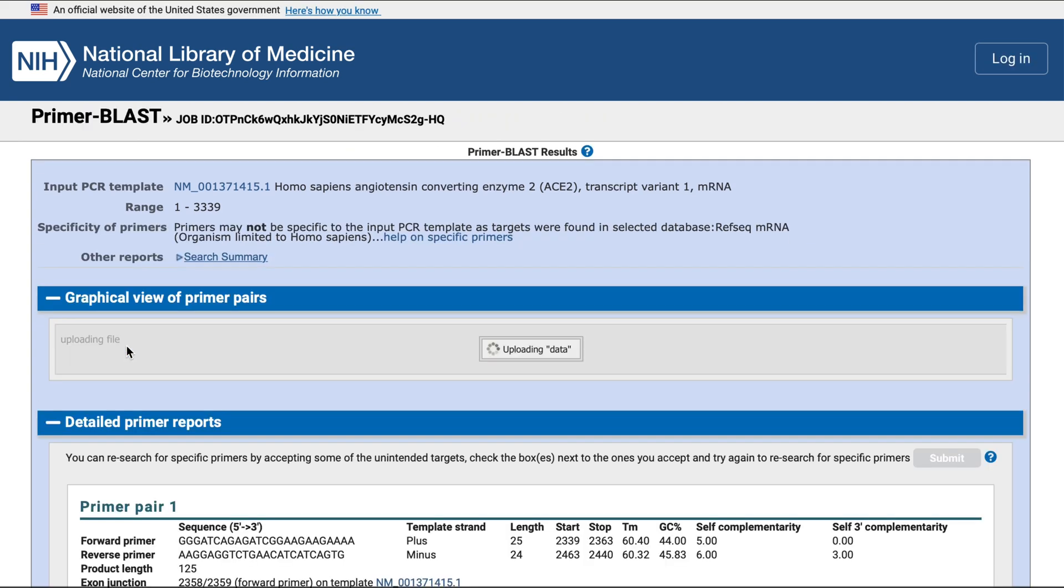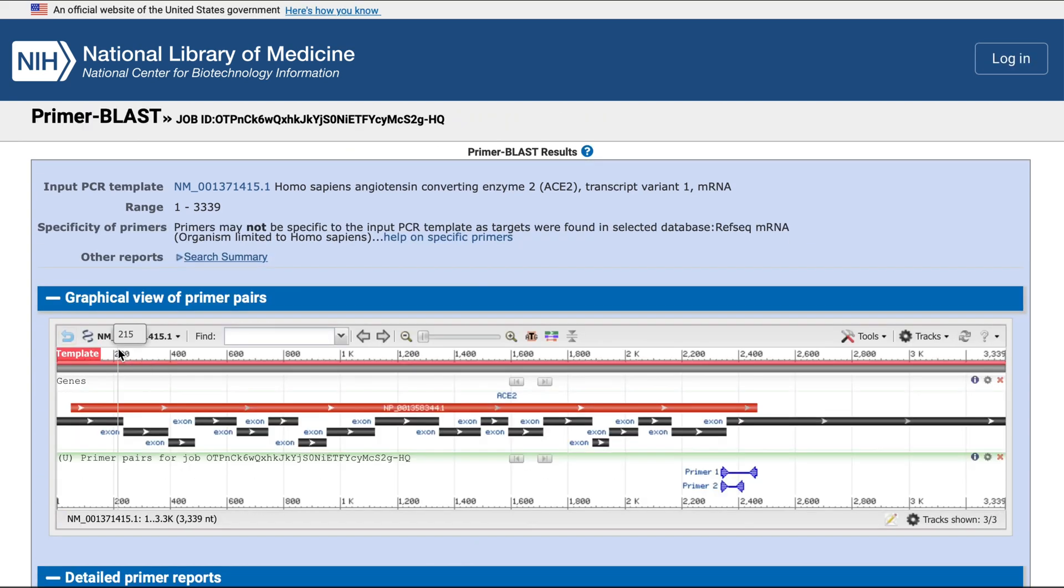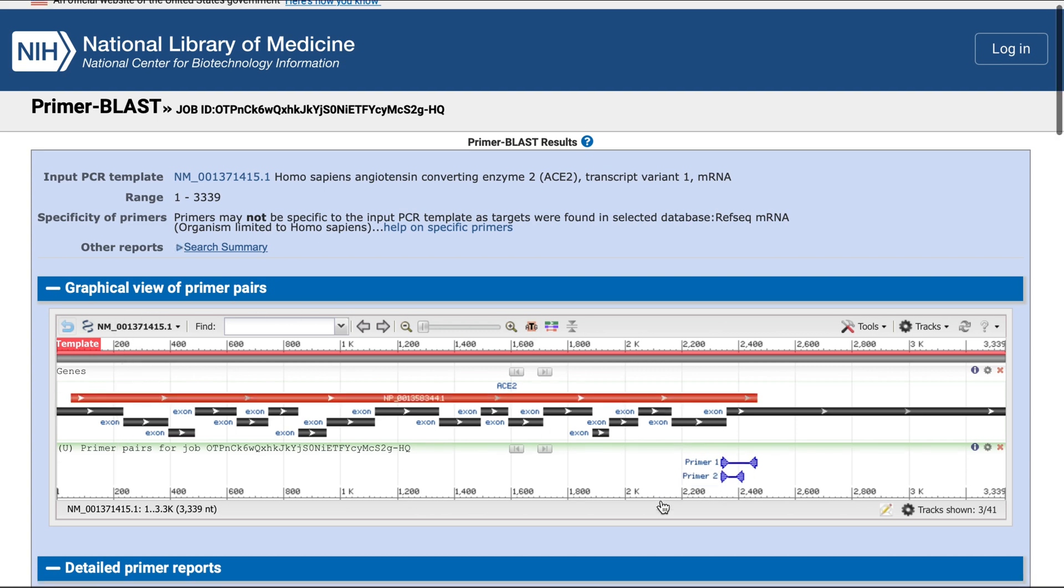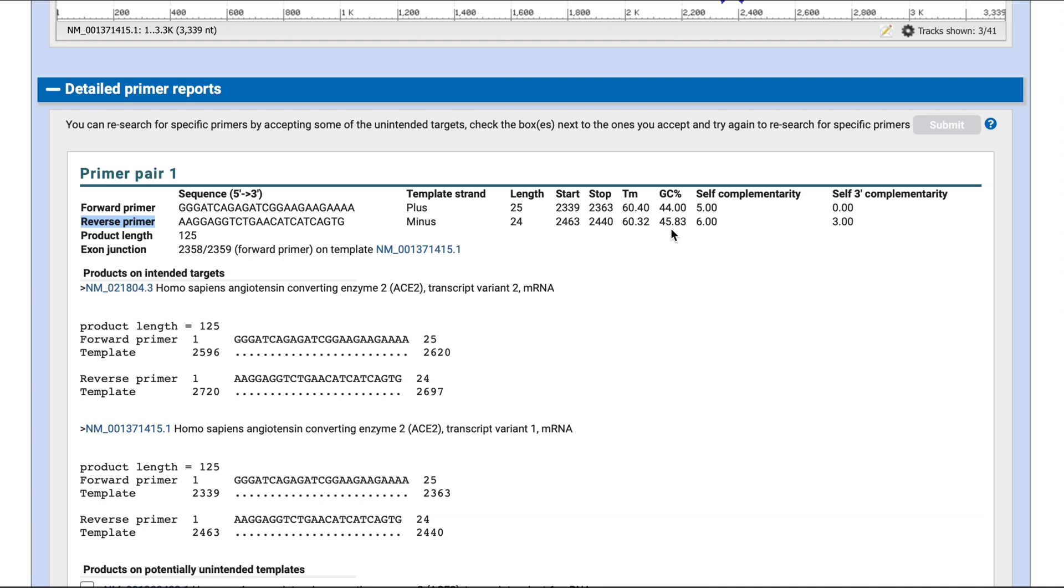Here's the program's output page with a list of primers to choose from. This is a graphic representation of your gene and where the primers are located. Scroll down to see the first primer pair. You have your forward and reverse primer sequence, their lengths, start and stop sites, the melting temperatures, and GC percentage.